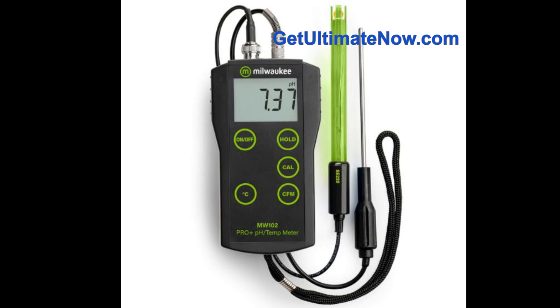You don't need a chemistry degree to use this meter. They highlight the large, clear digital display so you're not squinting at tiny numbers. The measurement process is really simple: you place the probe, stir gently, and wait for the reading to stabilize — that's it. No complex button sequences. It's designed for enthusiasts, and speaking of enthusiasts, they've got some great reviews from users.